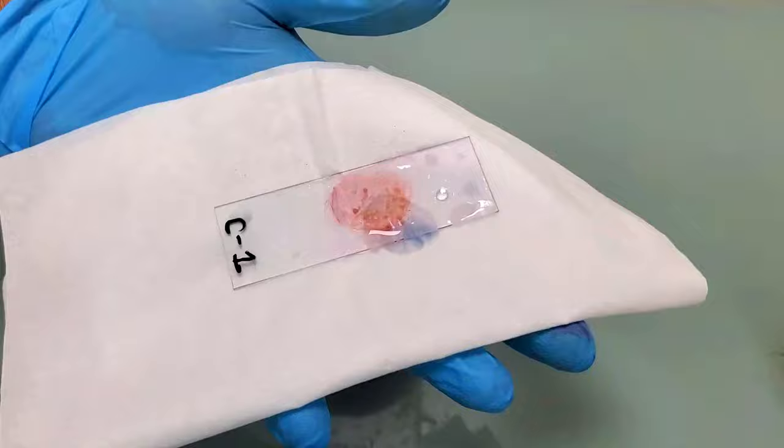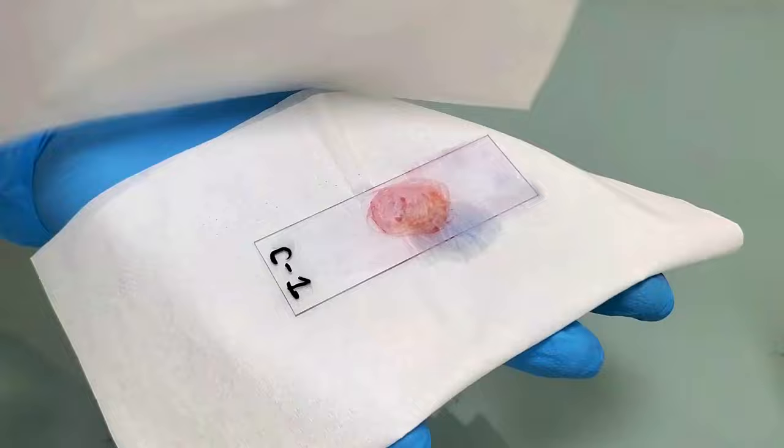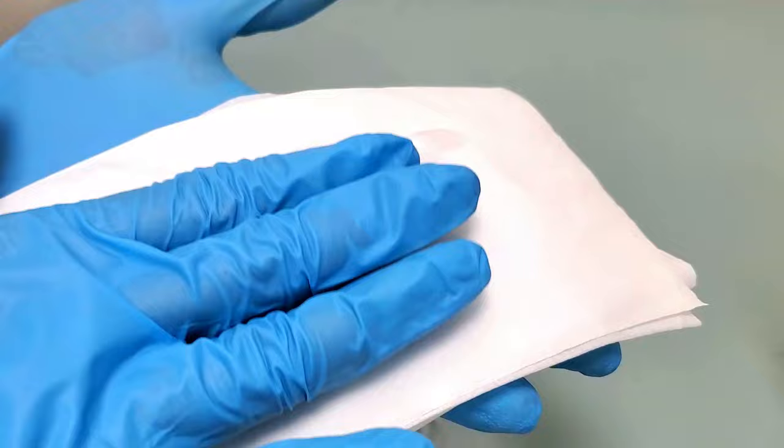Remove the water gently from the surface of the glass slide using a soft, absorbent tissue. Care must be taken so that the smear is not disrupted. Do not use the tissue in a wiping manner, because this can remove the smear from the slide.